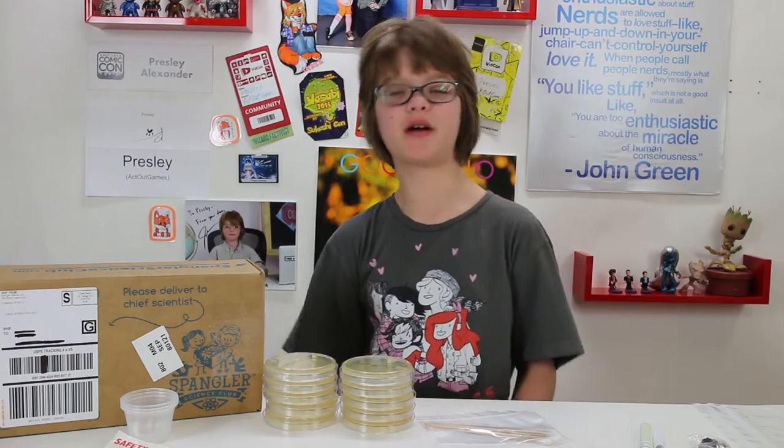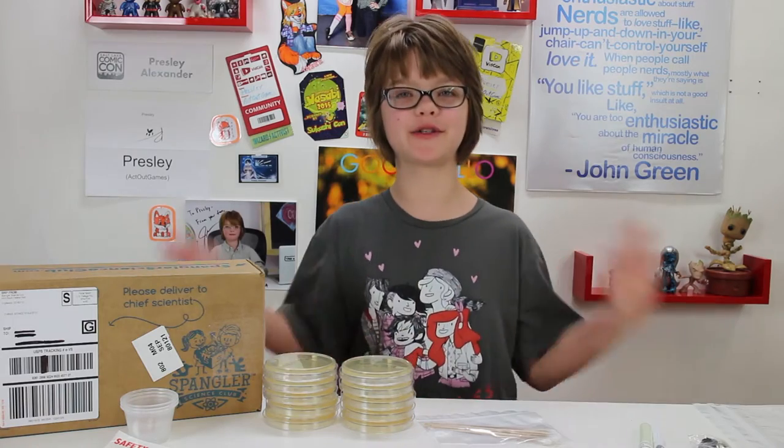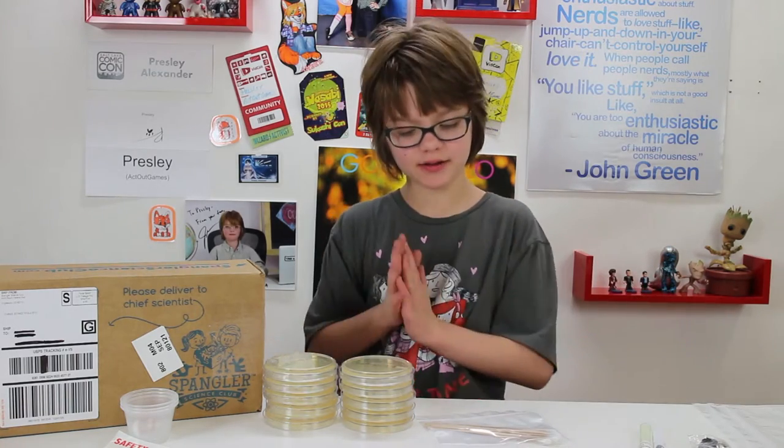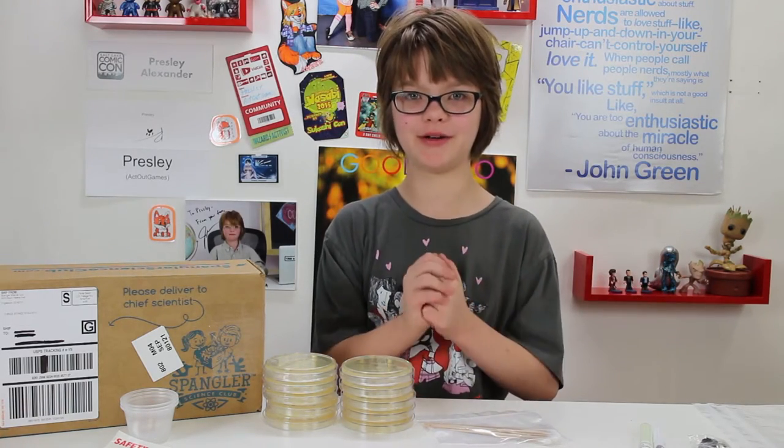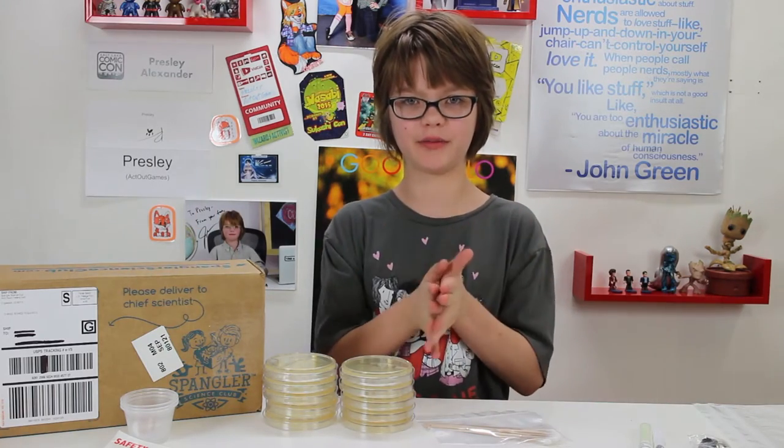Hey everyone! It's Presley and ActOutGames.com here, and today is Science Sunday, and we are finally going to be doing another Steve Spangler Science Club kit. So this one is all about growing bacteria, which is really cool experiments, and I'm super excited to get started with it.